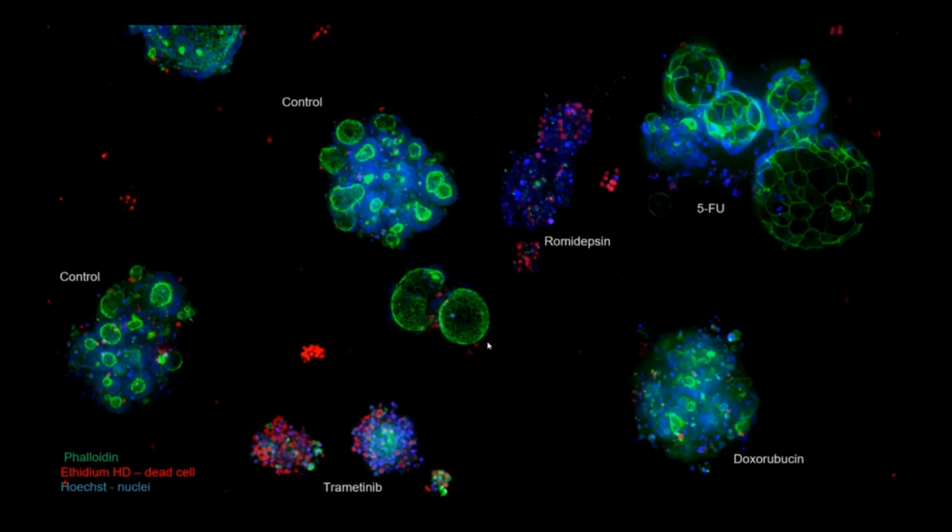Now, while luminescence-based studies, such as the CellTiter-Glo assay that I mentioned earlier, can give viability readouts, and that's based on the presence of metabolically active cells, the CellTiter-Glo or luminescence-based assay is typically a single parametric readout, and it's more suitable when you are doing high-throughput target-based screens. Now, with image-based assays, such as over here, you have the option to carry out high-content screening, which is a phenotypic-based approach. And generally here, you are focused on getting a comprehensive view of the system. You have the option and you can design your screen based on specific markers.